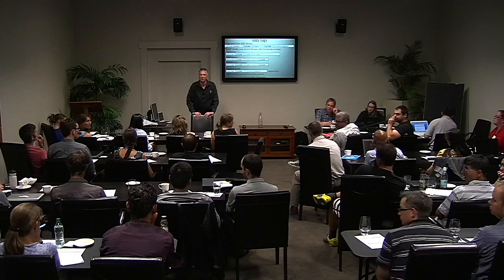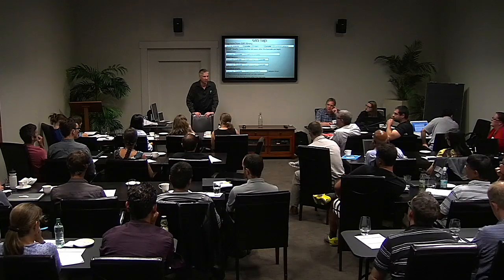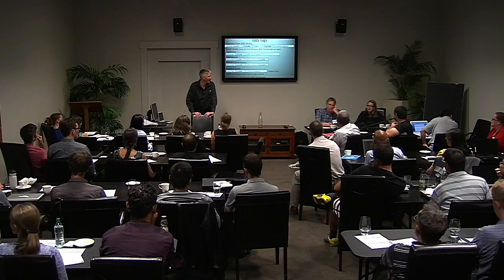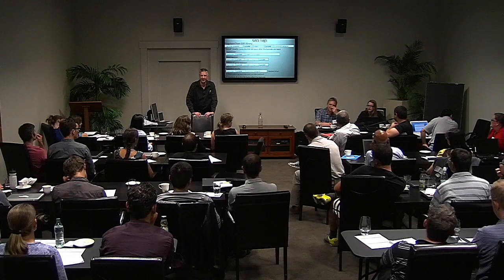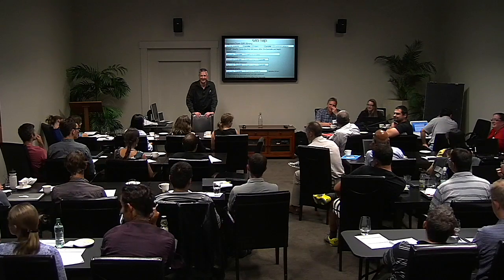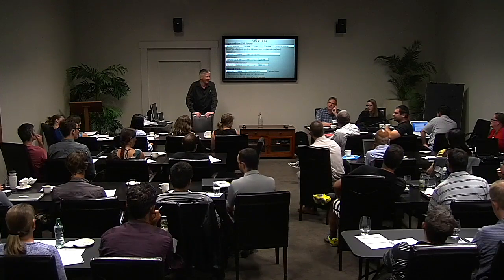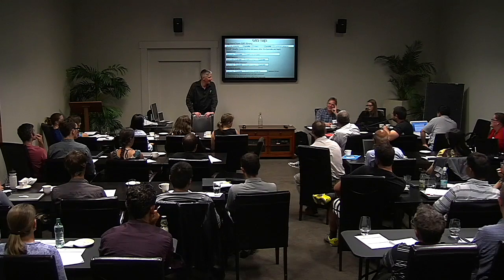I guess what I'm asking is why do you just throw out anything less? Why do you not even keep anything that's not 64 as a minimum? Do you keep 63? 62? 61? I would not keep anything less than 60. Well, you could be creating null alleles though if you do that. Because at the same locus, you could have some that have a cut site, some that don't. So some tags are 64, some are 60. I've seen that happen.